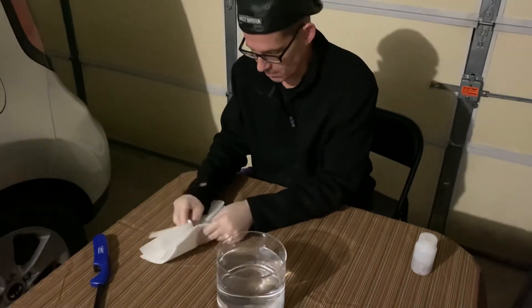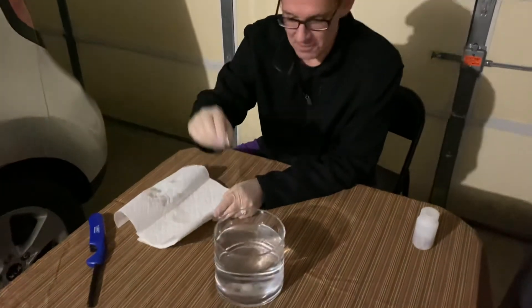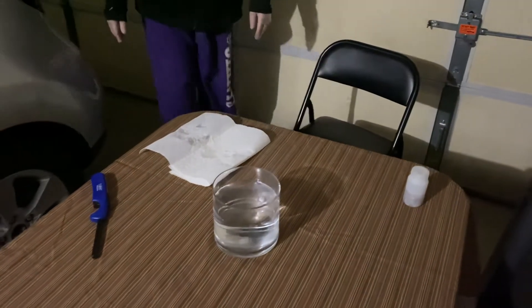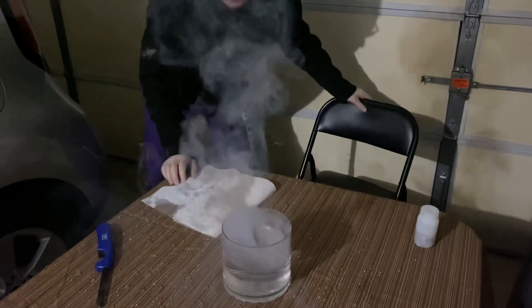I think I've got it just about dry enough and we're ready. Here we go — check it out. Right away you see that hydrogen coming on. Wow! Huge reaction. Pretty cool.